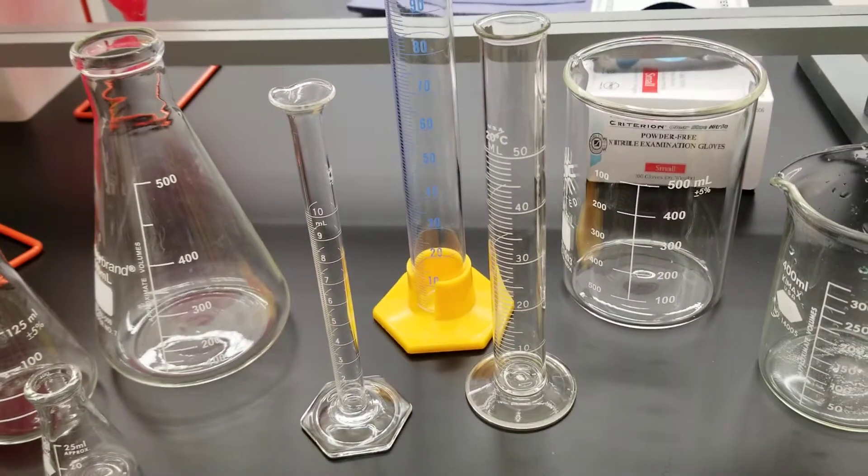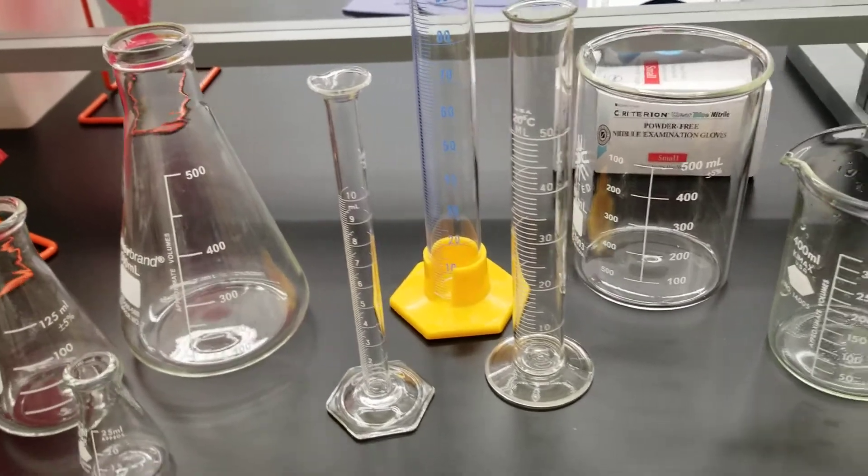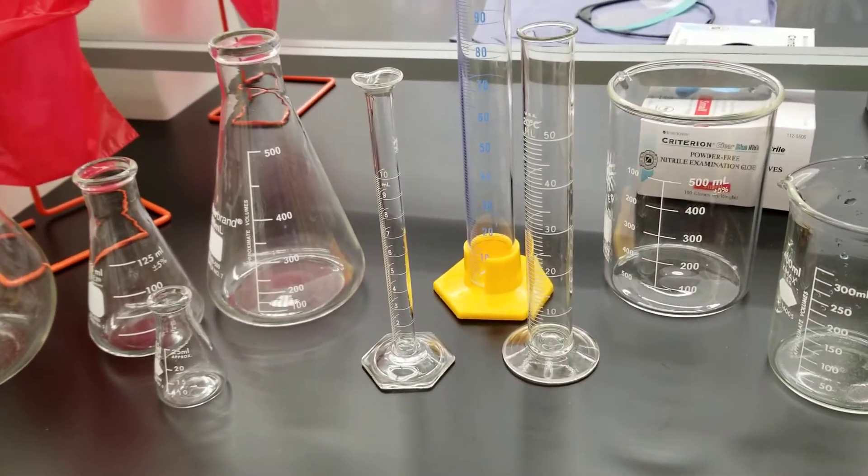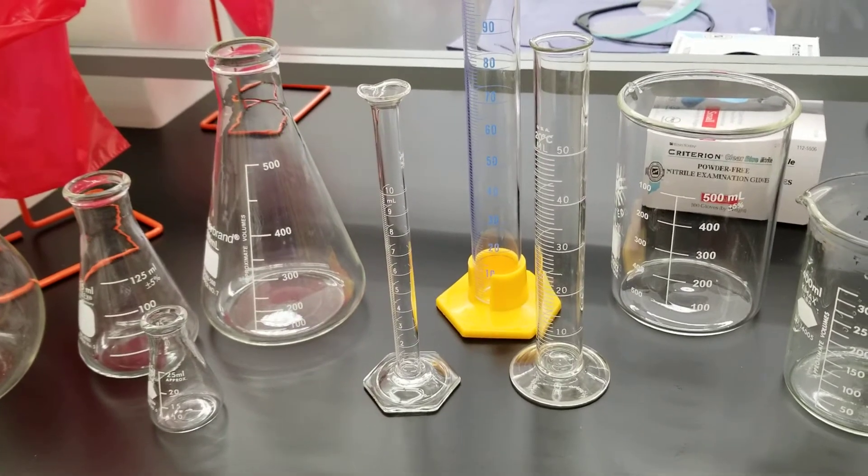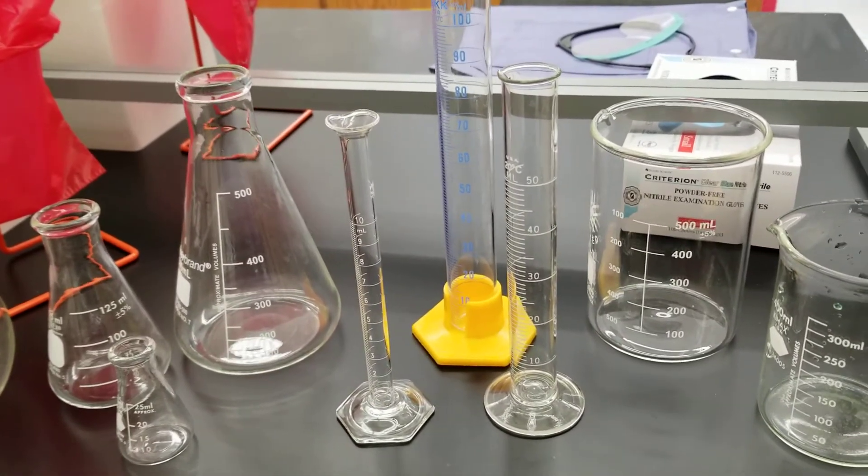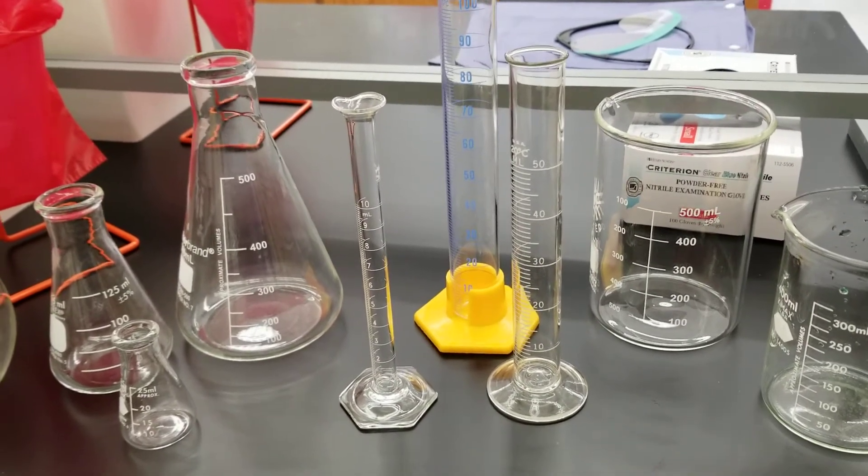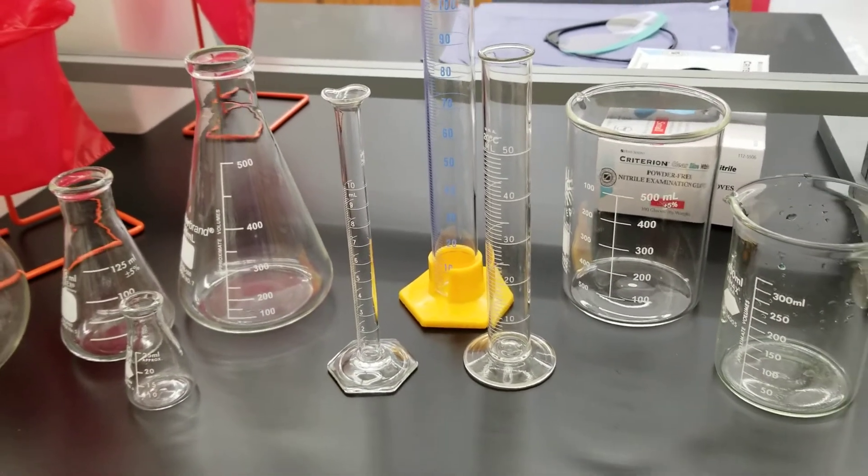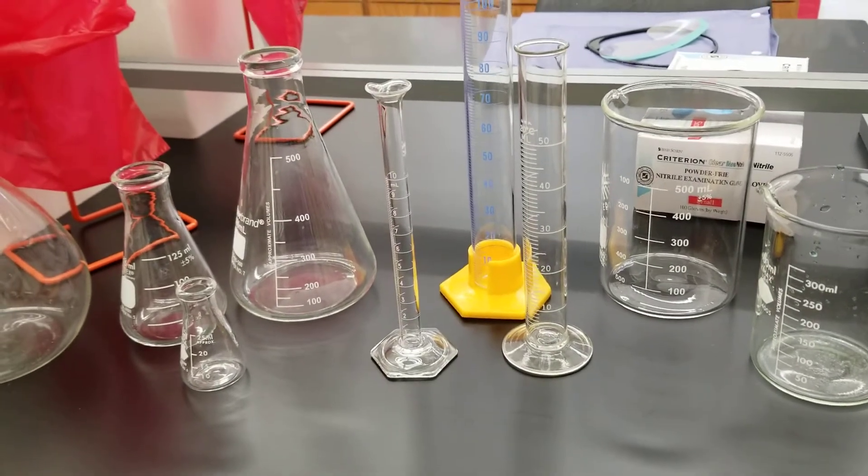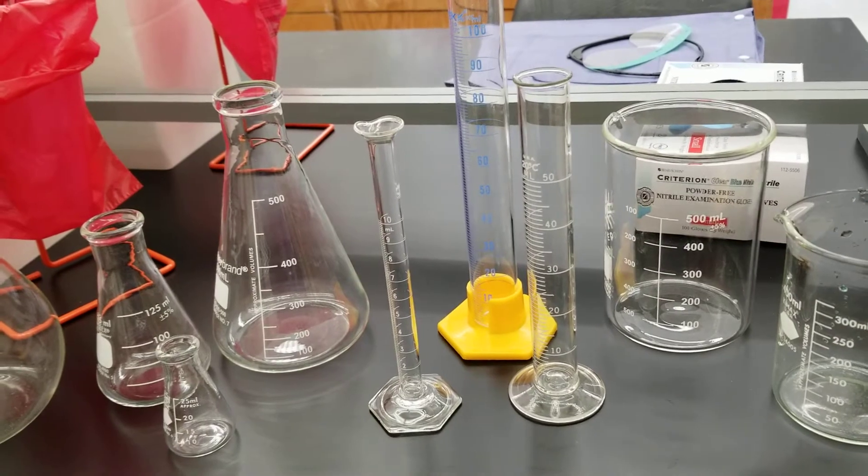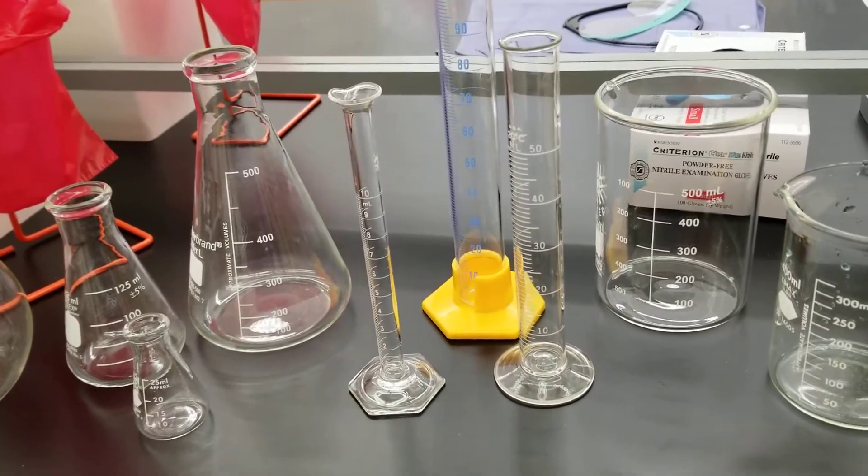In the classroom lab that we have, we do an exercise where we use a graduated cylinder to measure the accuracy of the volumes that are coming out of the different pipettes that we use. Now, the important thing with all of this glassware is that you want to remember to use the size that most befits the volume that you're looking to measure.